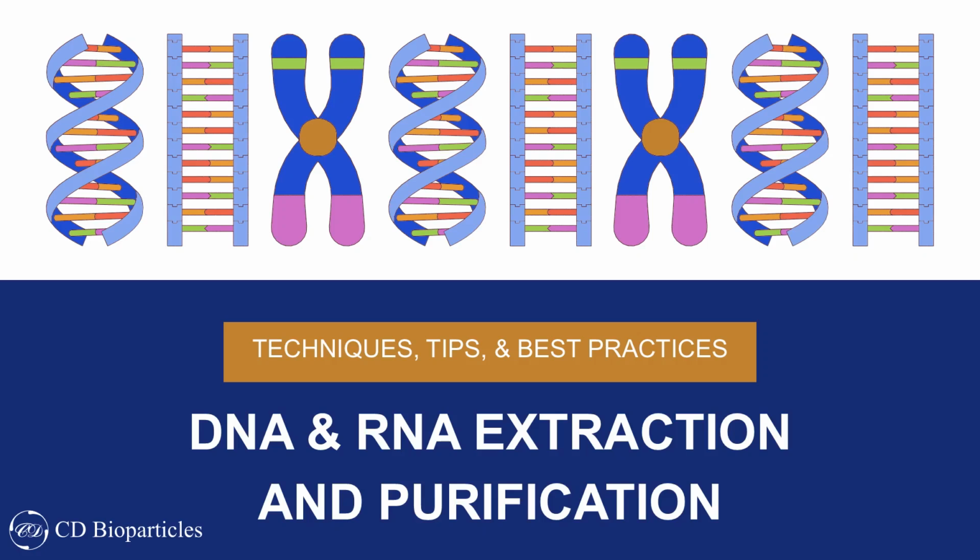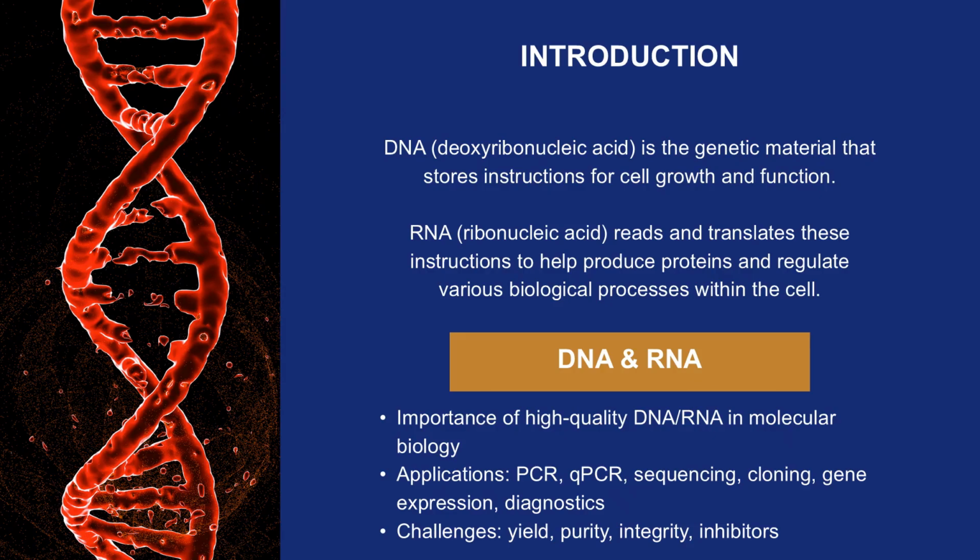In this presentation, I'll be walking you through the various ways and best practices for DNA and RNA extraction and purification. DNA is a double-stranded molecule that carries the genetic blueprint of living organisms. It contains instructions for building proteins and is responsible for heredity, determining traits passed from parents to offspring. DNA is found mainly in the cell nucleus.